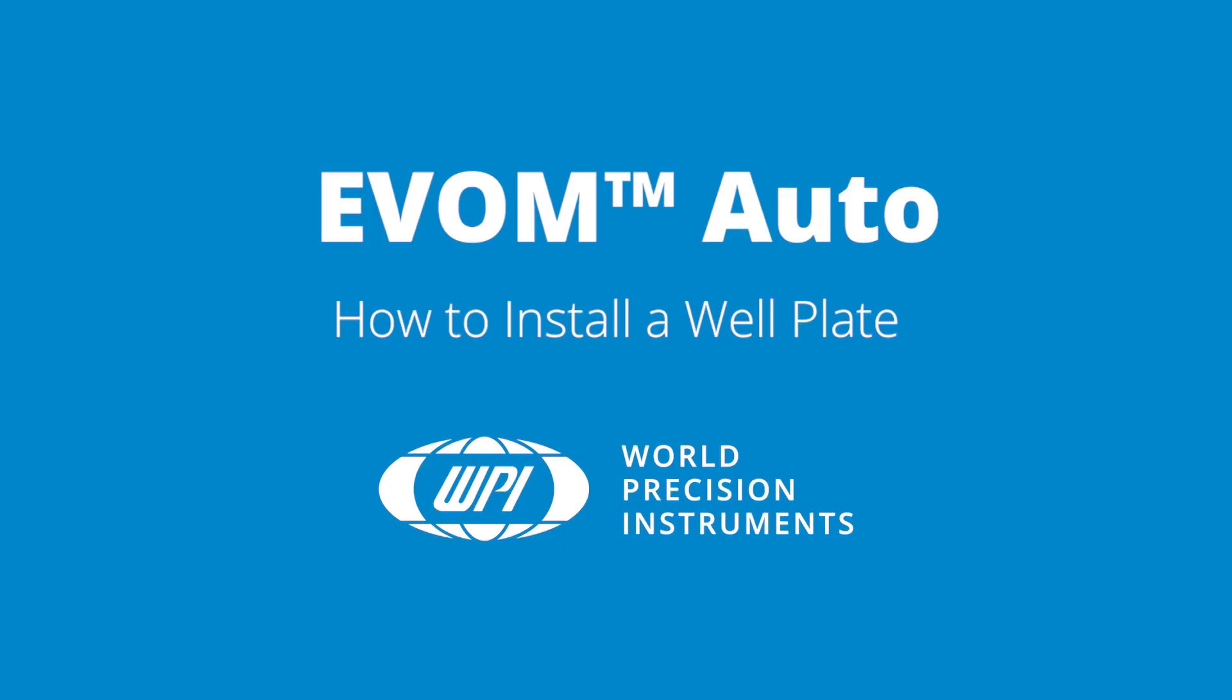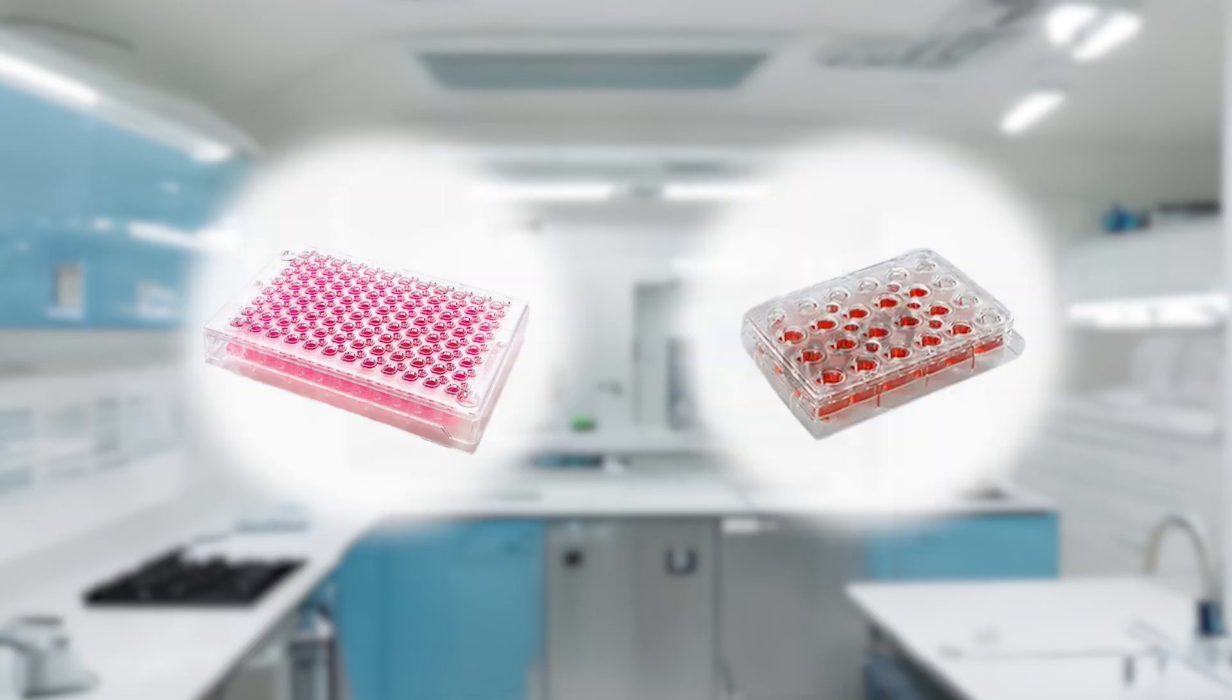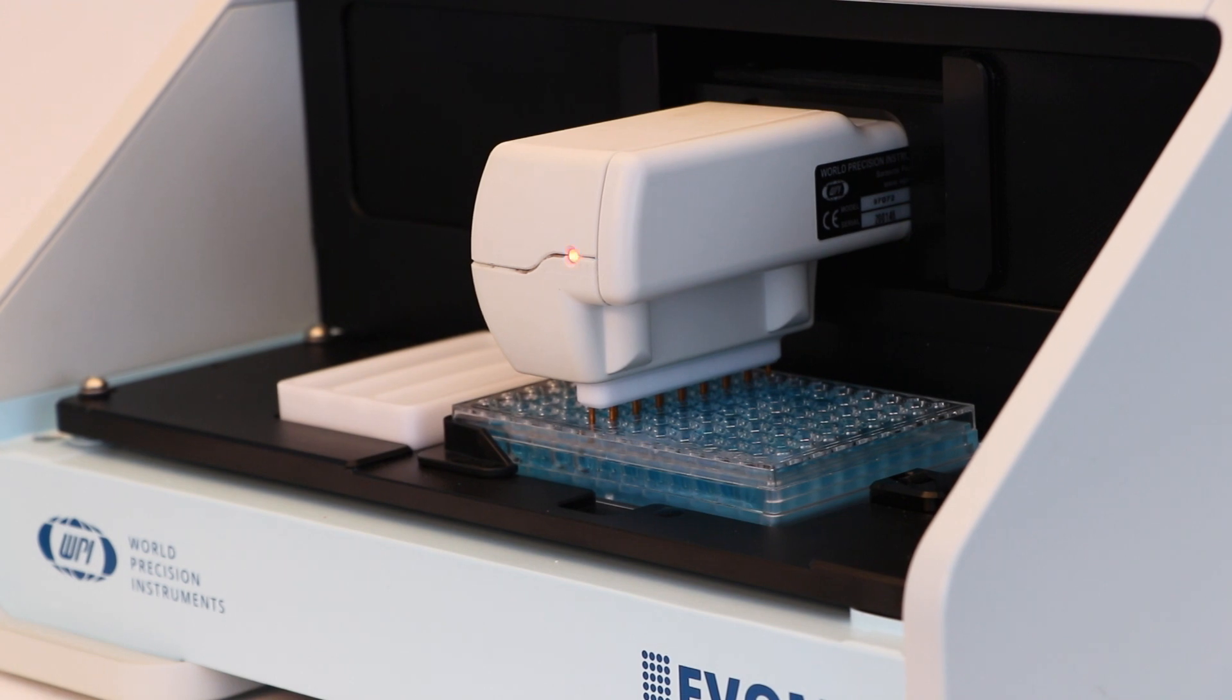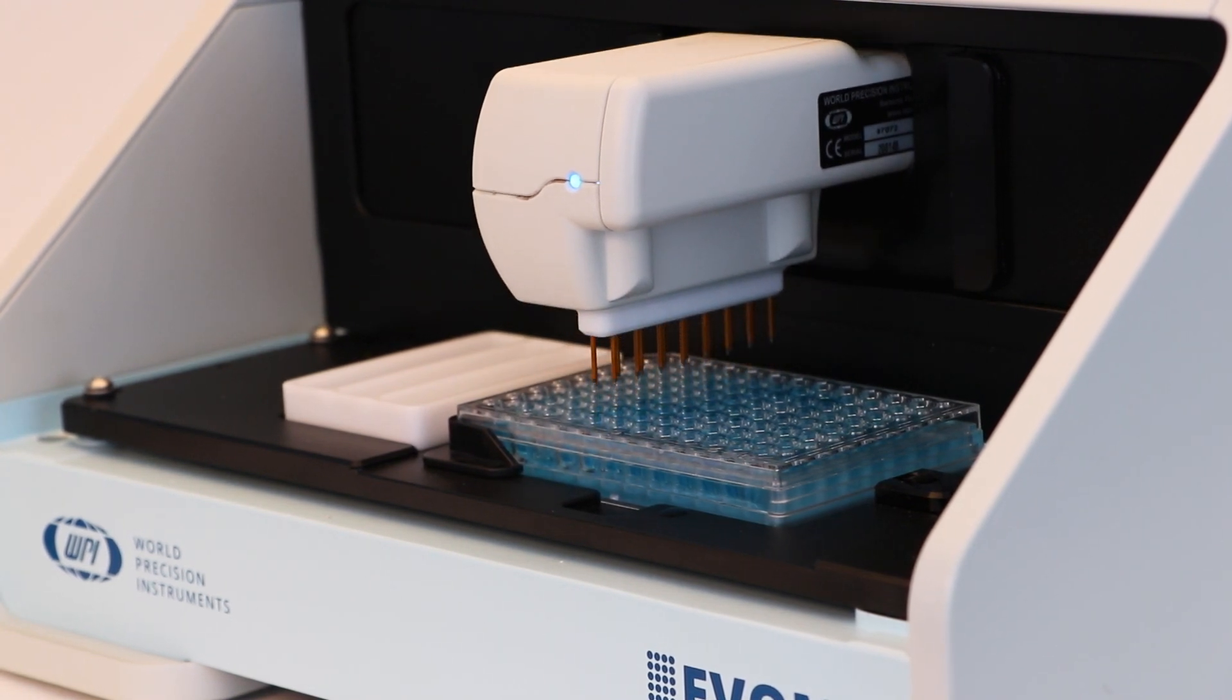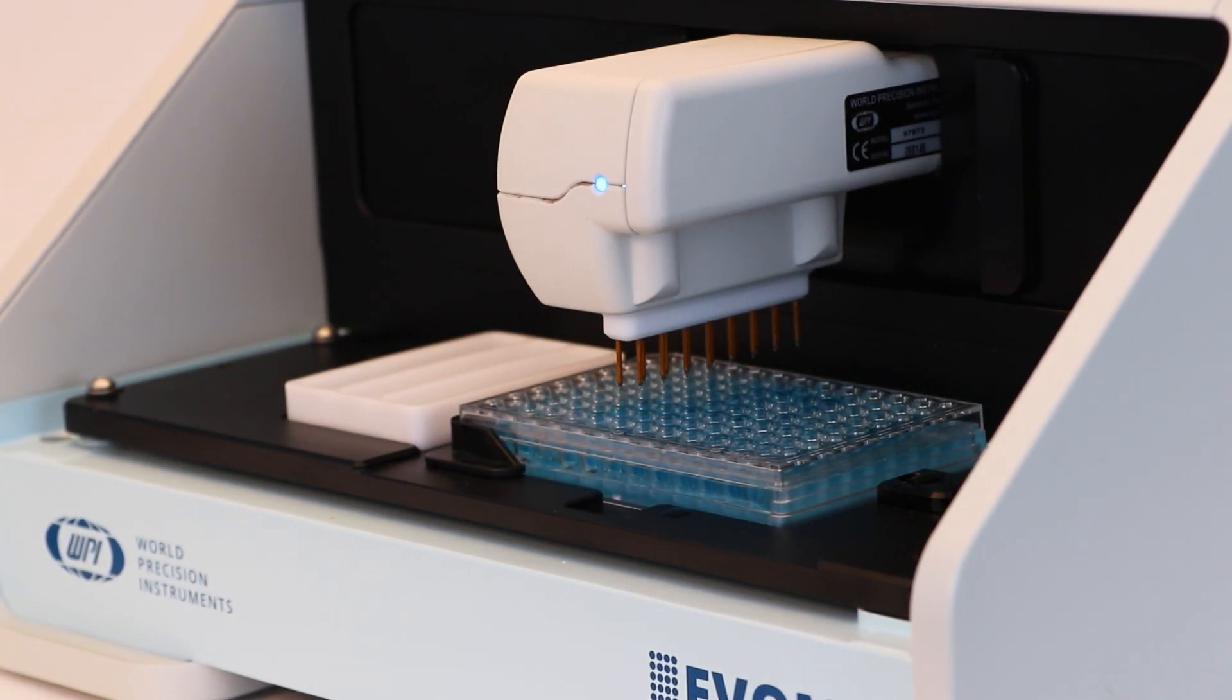EVAM Auto version 3 can switch between different 24 and 96 high throughput screening well plates by using matching electrode arrays and plate positioners. Here we demonstrate how to install a well plate.